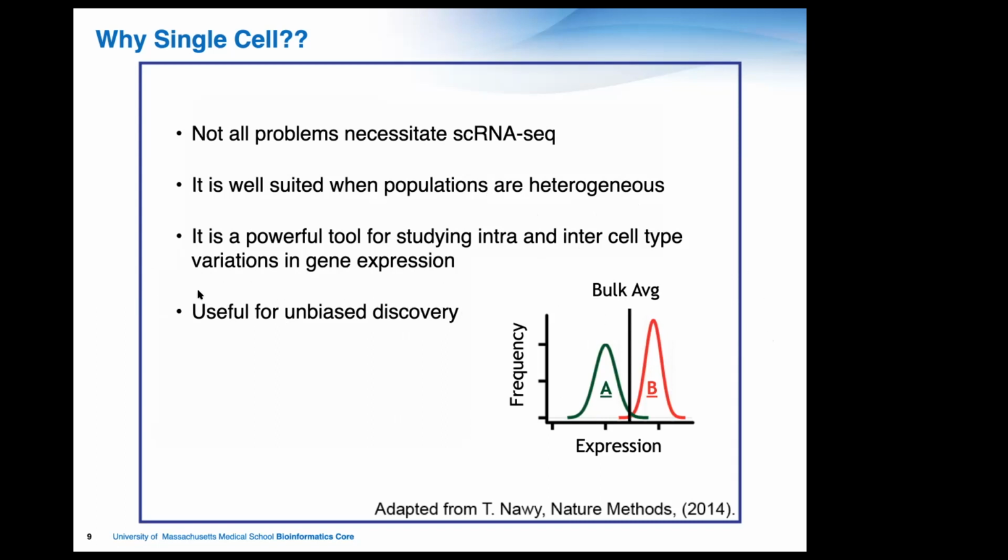If you think about a flow cytometry experiment where you take a sample and you stain it with antibodies and then you bring it to the flow core and you can read out how much each cell is expressing, or at least stained for, those proteins that you tagged them with. The problem, not problem, but one of the limitations of that approach is that you have to know what you're looking for to start with. You have to know exactly what protein you want to stain for, whether or not those proteins are good markers for the cell type that you're looking at.